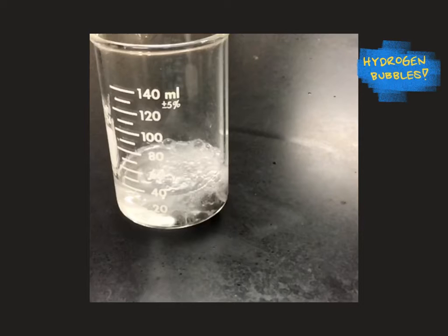If you have a look at the chemical equation we're writing down here, that reaction is zinc, a metal, which is a solid, reacts with hydrochloric acid in what we refer to as an aqueous solution to produce zinc chloride, which is dissolved in the solution, and our second product again was hydrogen gas.